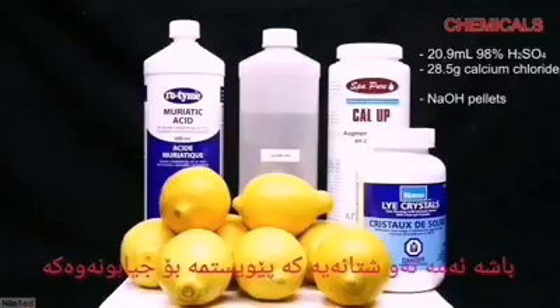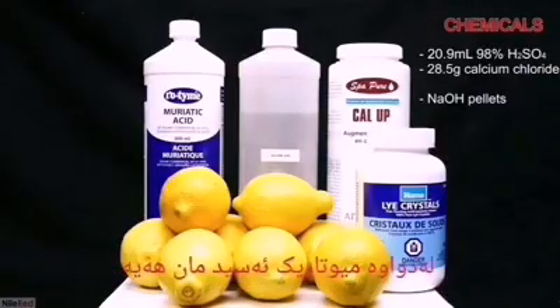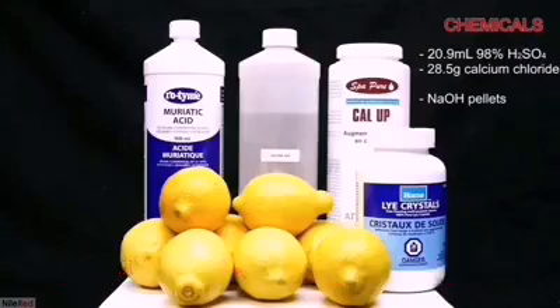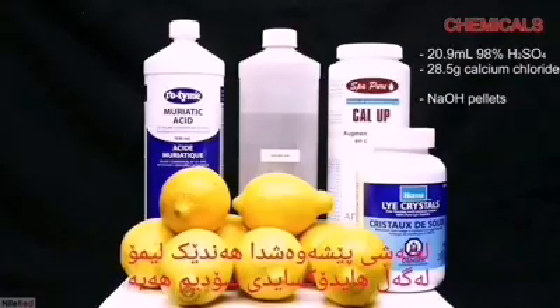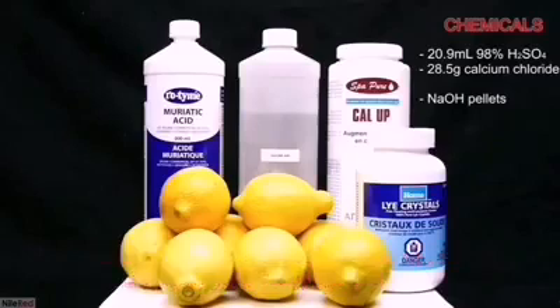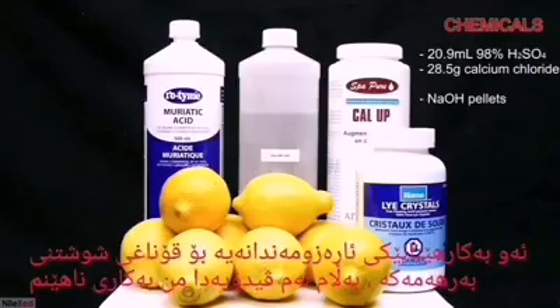These are the supplies that I used. In the back, we have muriatic acid, concentrated sulfuric acid, and calcium chloride. In the front, there's a whole bunch of lemons, as well as some sodium hydroxide. Even though there's muriatic acid in this shot, it's not going to be used in this video — it's used in an optional washing step, which I decided not to do.